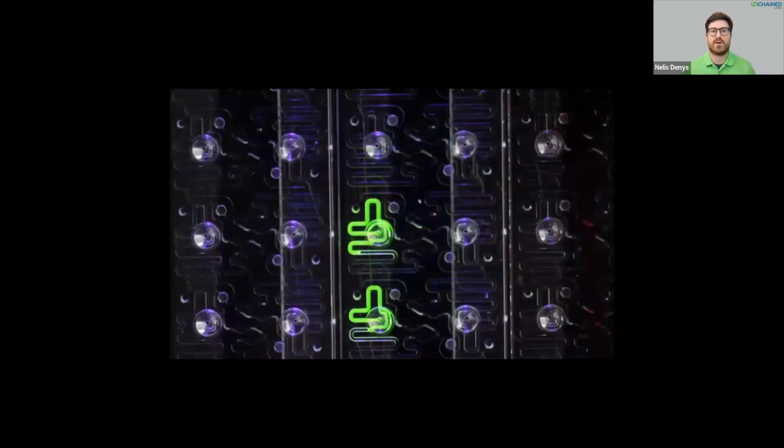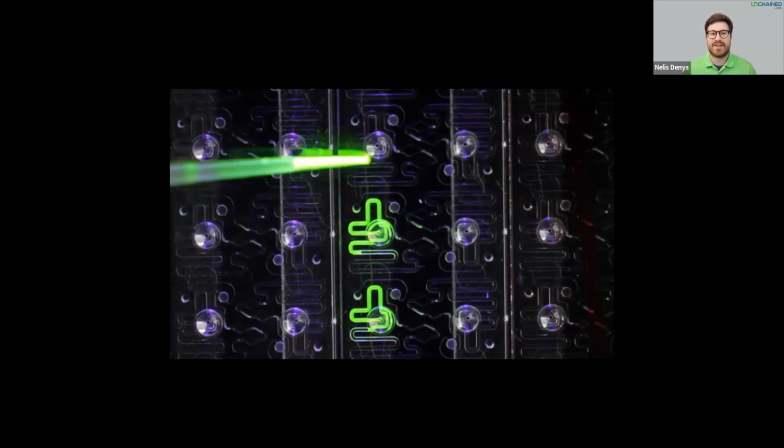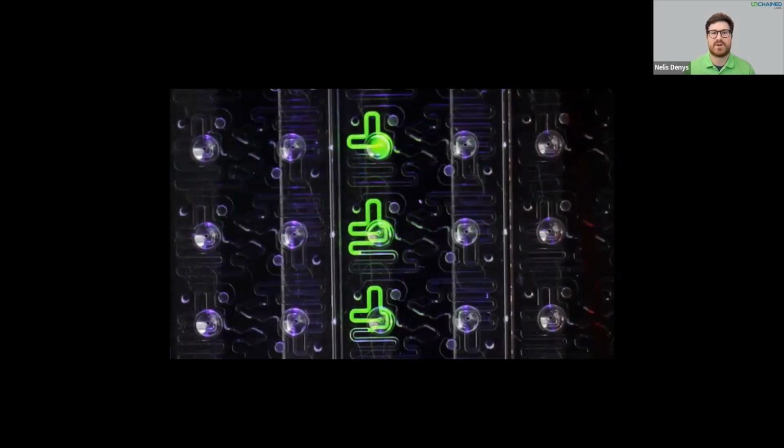And here we can see exactly what sample loading looks like with the help of some fluorescein and a black light. In 2 wells, there's already 2 microliter of fluorescein preloaded. And as you can see, to load another sample, you just simply add in that 2 microliter and it automatically wicks into the plate.